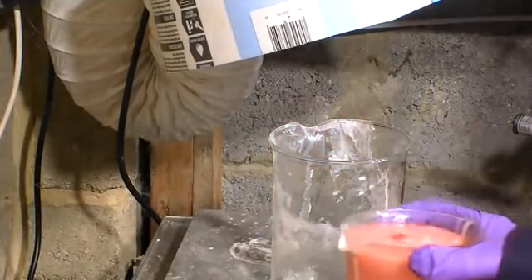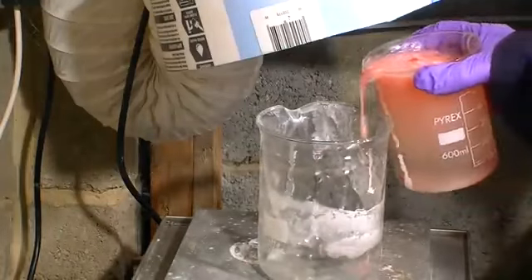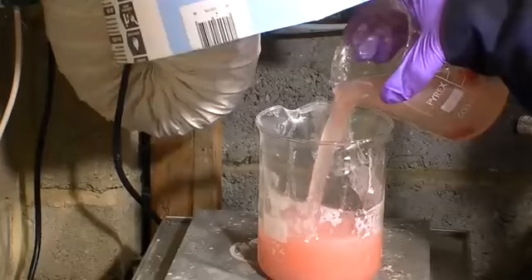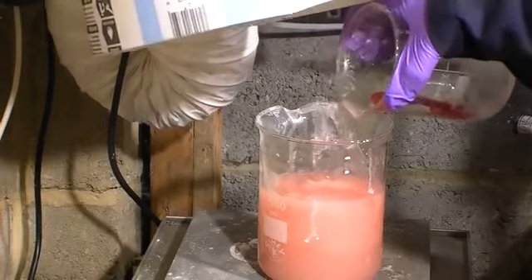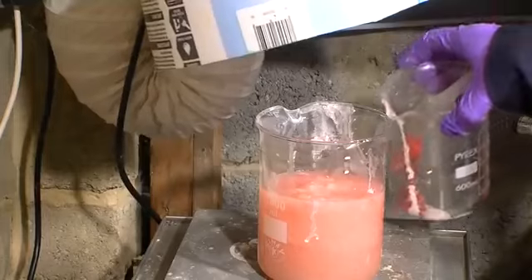After about an hour, when we decant the solution, you can see quite gruesomely that the chicken drumstick has effectively turned into a liquid soap, and all that's left over is a chicken bone. So this illustrates the potentially dangerous nature of sodium hydroxide solution.